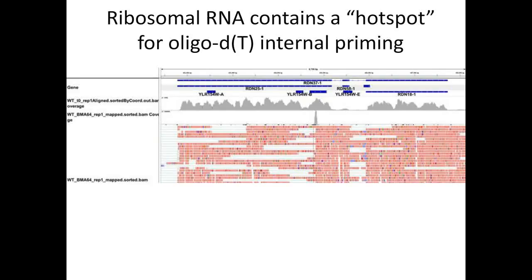And so in this particular case, you're seeing the gene encoding ribosomal RNA, which is encoded by multiple copies in the genome. And a comparison of the whole transcript sequencing, which results in background due to this abundant transcript, with the 3' end sequencing reveals a hotspot that is specific to 3' end sequencing. And this is a contaminant in the data set, and this actually corresponded to 30% of all the reads in our data set.